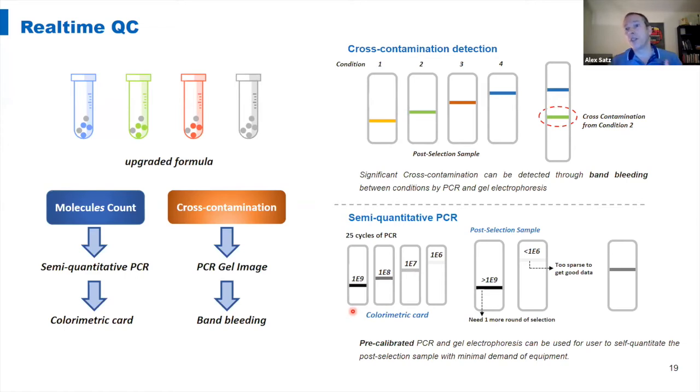Because of course, if you send us a kit with these QC problems, then chances are the result of your screen won't look good and you won't find hits. And so it is, in those cases, probably better to start over.